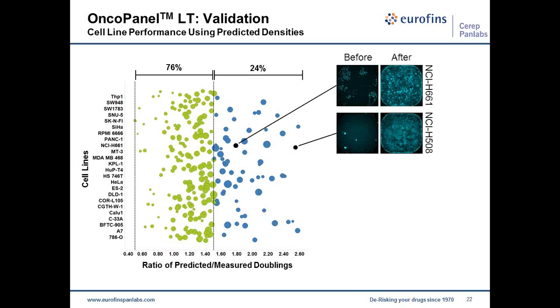When we looked carefully at these cell lines, one of the things we noticed was they didn't really grow well at all. One of the reasons we think this is the case is that some cell lines do require some paracrine mechanisms to keep them happy during growth.